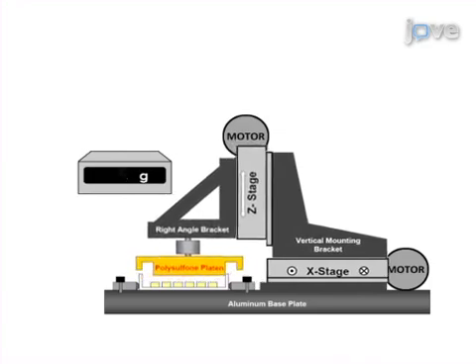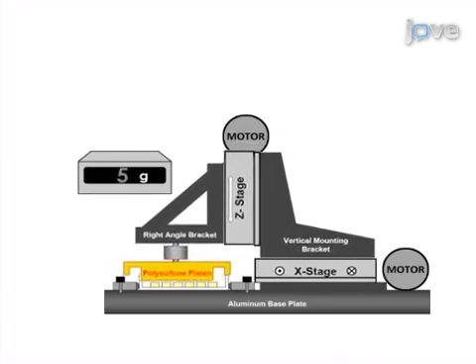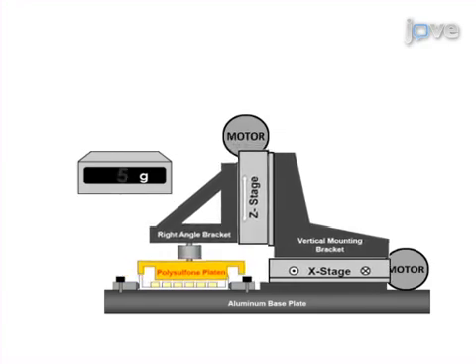As a second step, the bioreactor is outfitted with a load cell, which provides force feedback and mechanical testing of the biocomposites during loading.